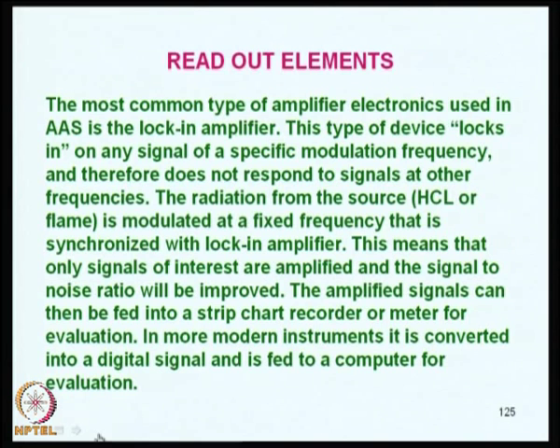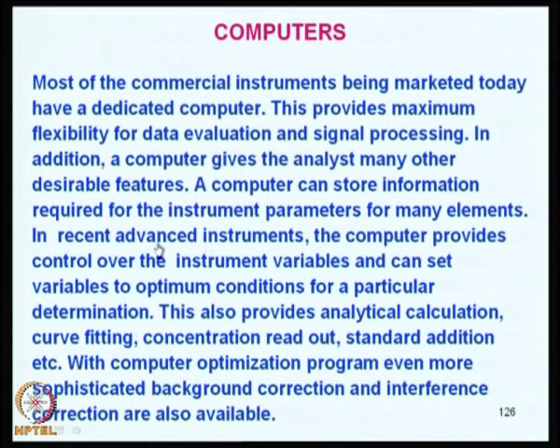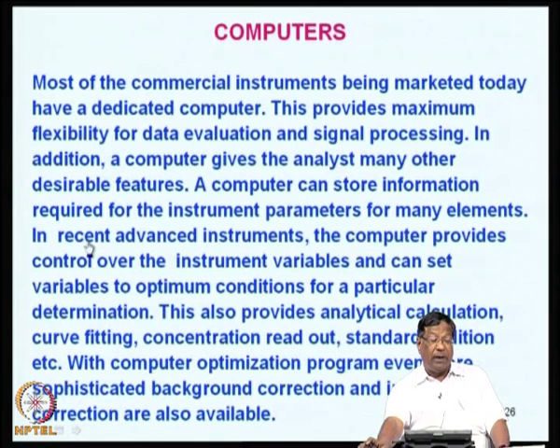That means all other frequencies would be rejected from the strip chart recorder. So, the role of computers becomes very important, especially when we take into consideration the multiple types of functions and precautions and the requirements of data handling.